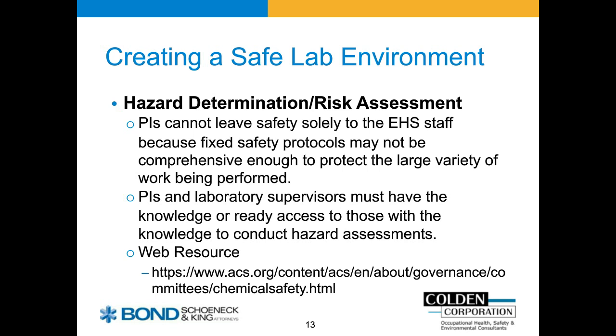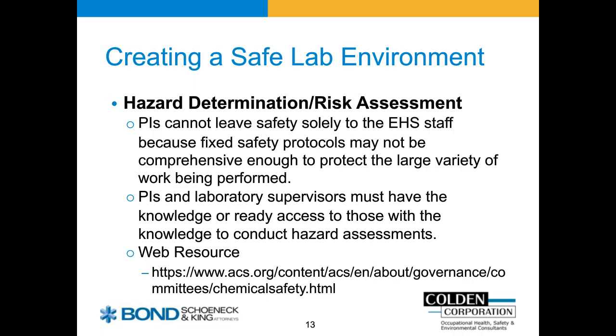There's an antidote that you should have around, calcium gluconate. It's a gel, in case of an emergency or exposure. So we were doing an audit in this lab. My partner and I went over to the jar of calcium gluconate to make sure he had it. And we opened it up, and oh my gosh, 2/3 of it is gone. So we were instantly concerned. So we went to the principal investigator and said, oh my gosh, 2/3 of this bottle is gone. What happened? There was no reports of an exposure incident.